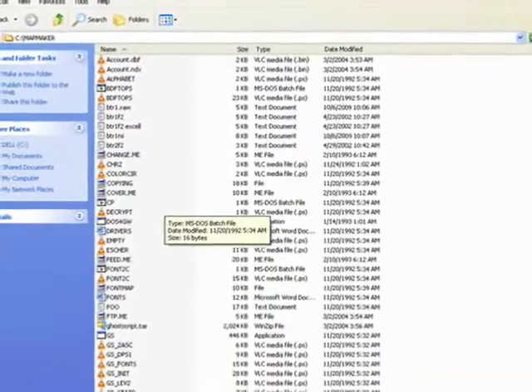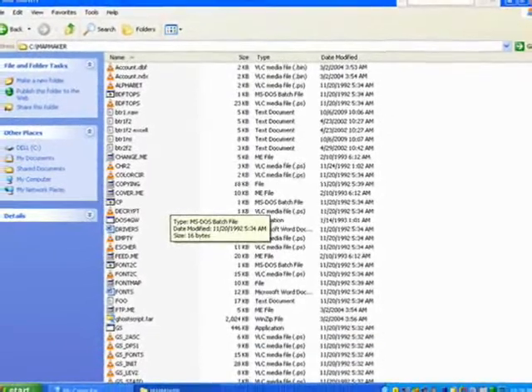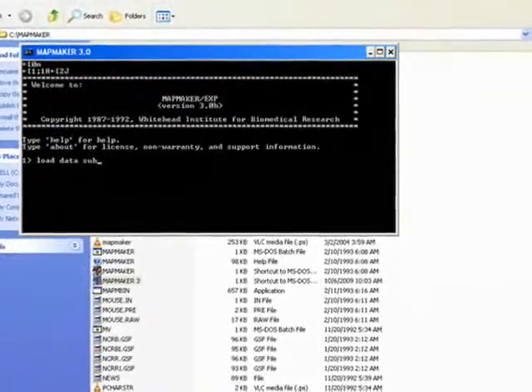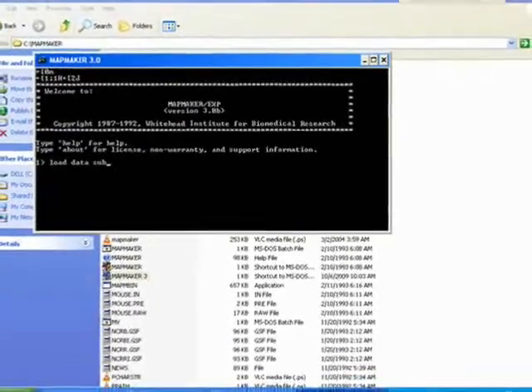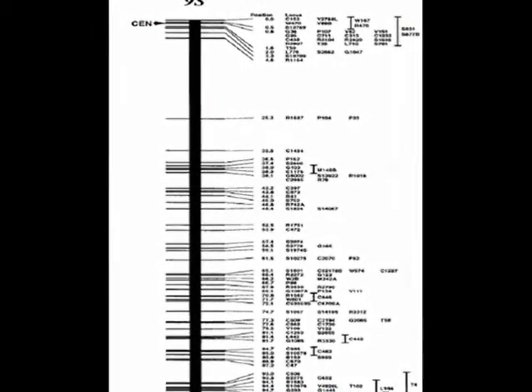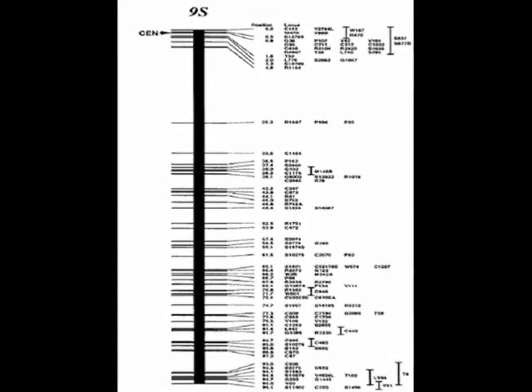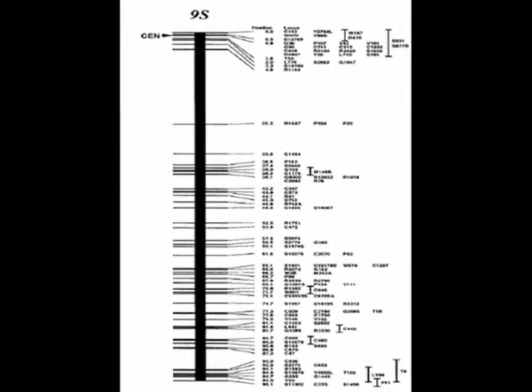MapMaker version 3 is used. The text format of the data is loaded and comments are given. Finally, we obtain the linkage map. This is the linkage map of chromosome 9 in rice, which contains the Sub1 locus that confers resistance to submergence.